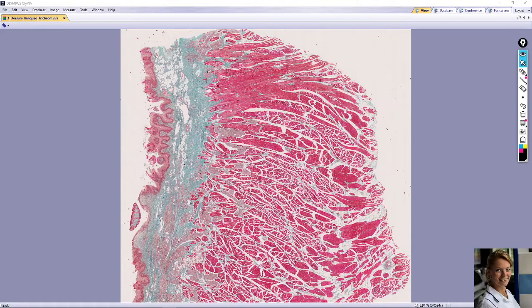In this video we will take a look at the slide of the dorsal part of the tongue, also called dorsum linguae. This slide is stained with modified green trichrome, which means collagen fibers are green, elastic fibers are black, and muscle tissue is red.